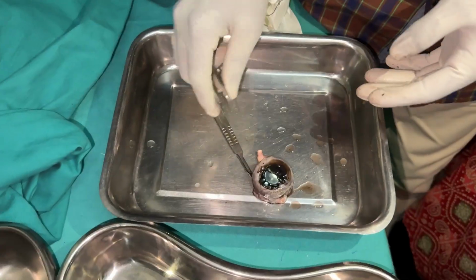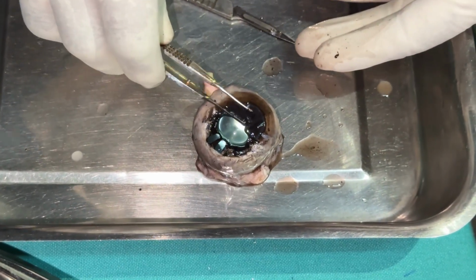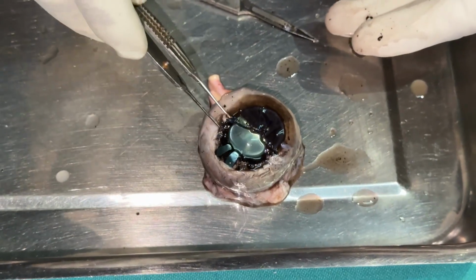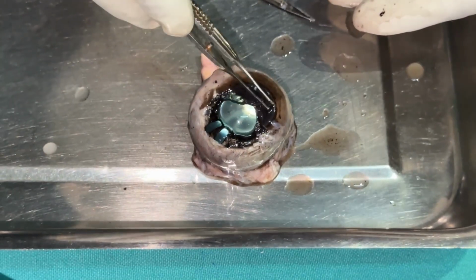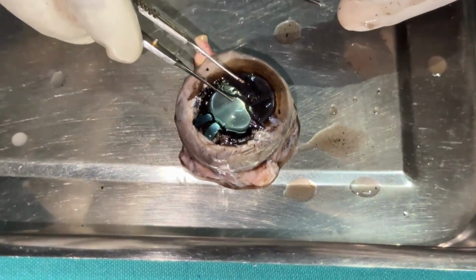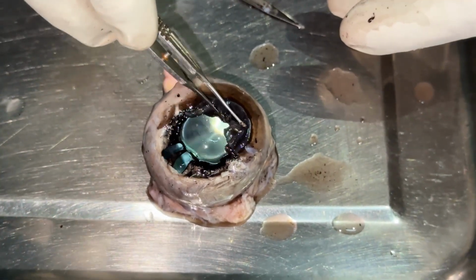Of the cornea, immediately what we are seeing is the iris. Half portion I protect and half portion I remove, only for understanding. In this area I removed the iris, and this area is the iris muscle. You understood? You take a photograph of this, and we can see our lens, the human lens. You notice that this is a bullseye lens. We will have a capsule over the lens. I'll show you how to separate the capsule.